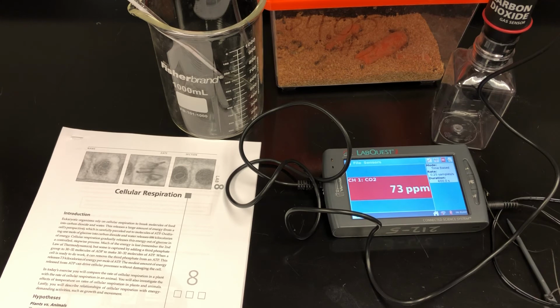Normally in the lab, I would have 4 groups, and one group would do room worms, one would do cold worms, one would do room sprouts, and one would do cold sprouts, and then we pool our data. But since I'm here in the lab by myself, I'm actually going to set up 2 at a time. So I'm going to have the room temperature running at the same time, and then I'll record the data, and then I'll run the cold temperatures at the same time, and I'll record the data, and then I'll be sharing all of those data tables with you later in the lab.